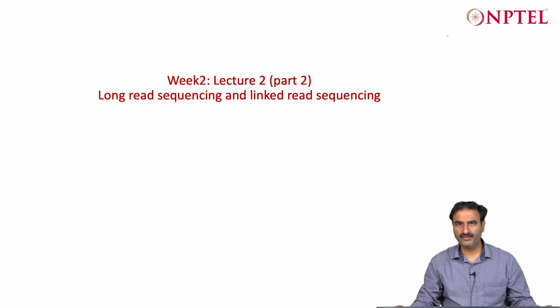Hello friends, welcome to lecture 2, part 2 of week 2. In the past lectures we have looked at short read and one long read sequencing technology. In this lecture we will briefly brush up those concepts and also move forward with another long read sequencing technology, and a new technology from Illumina for link read sequencing.